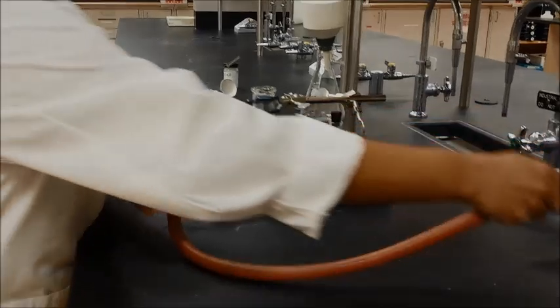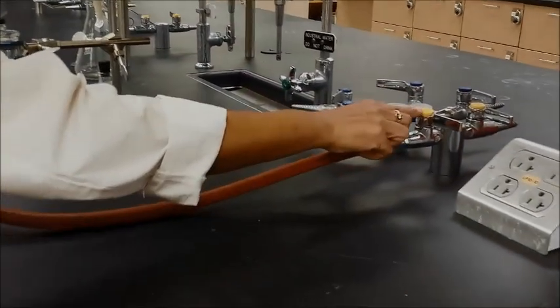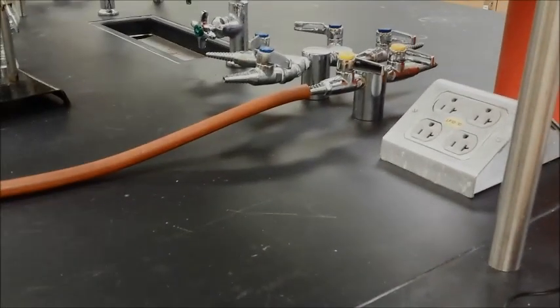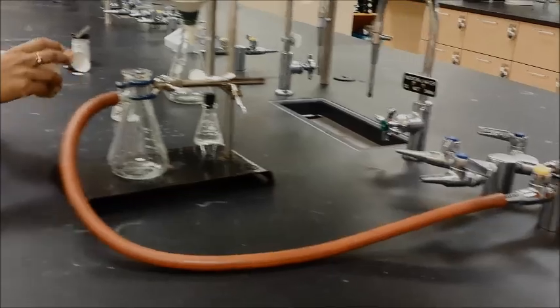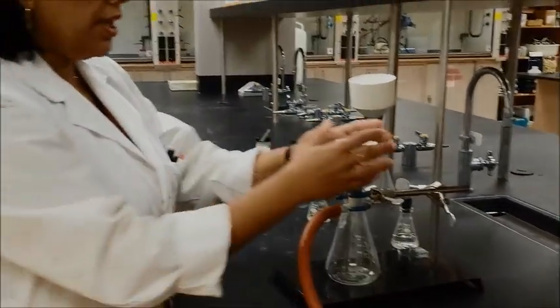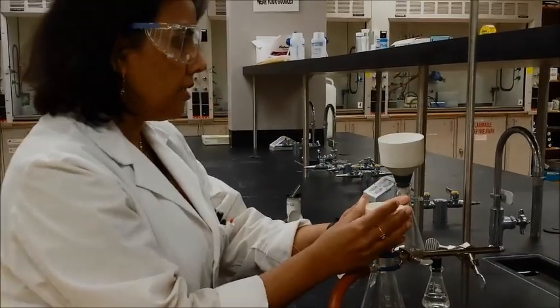So, you need to put the vacuum tube in here and then the vacuum tube right here in the vacuum outlet. Once that's set, then you can go ahead and set in your Buchner funnel.